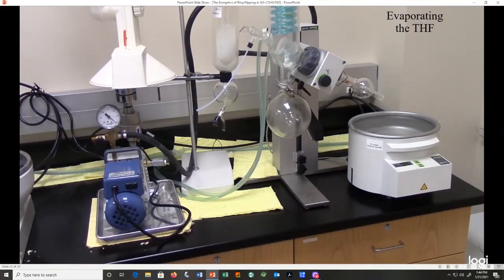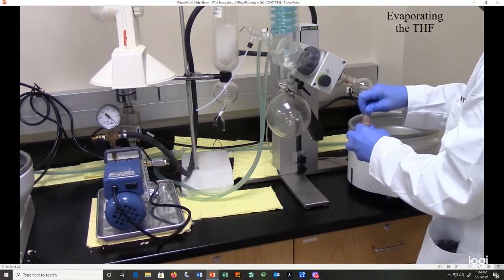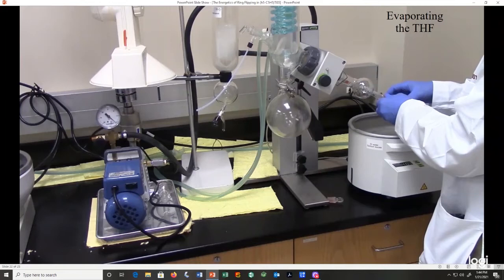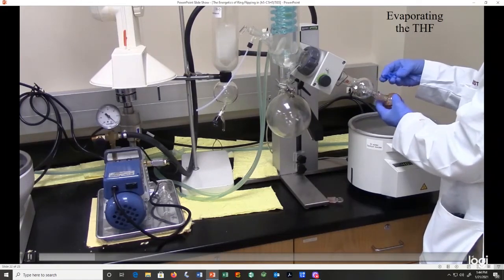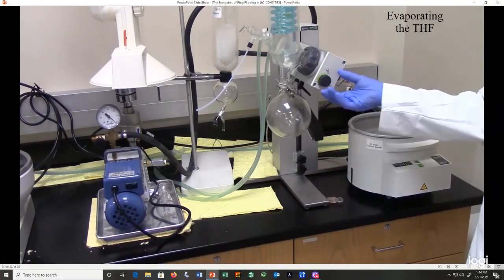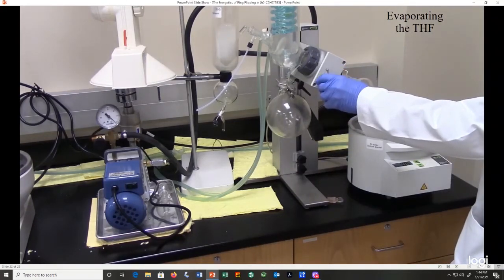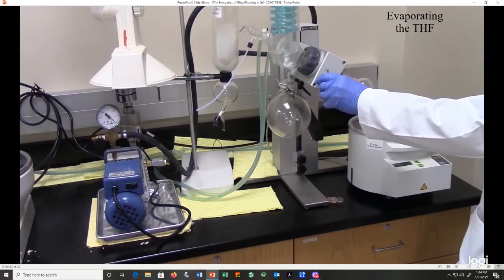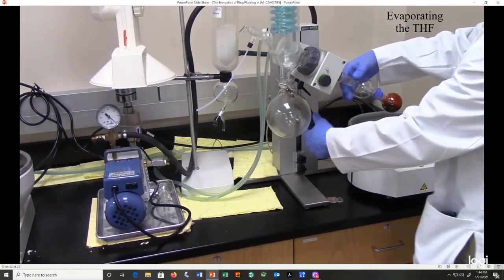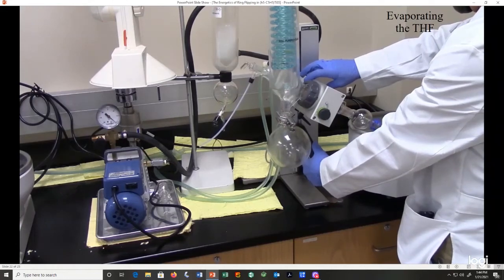First, we're going to make sure that the vacuum pump is open to the atmosphere. We don't want to turn the vacuum pump on and have so much pressure that we force liquid into this bump trap up here. So we're going to put our solution on there, put a Keck clip on there to make sure the round bottom flask doesn't fall off. And now we're going to start that round bottom flask rotating around so we can increase the surface area for the evaporation. And then we're going to lower that arm down into the heating bath.